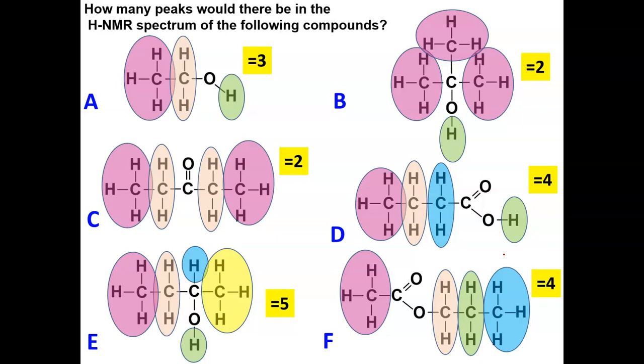The next molecule, C, as you can see, is a ketone. It's also a symmetrical ketone, pentan-3-one. Remember, we had this issue with carbon-13 NMR. We've only got actually 2 different environments, the 2 methyl groups and the 2 methylene groups. Of course, there's a plane of symmetry.